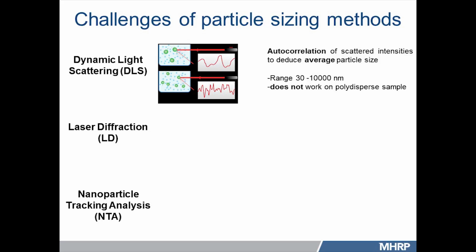But as I said, it does not work well on a polydisperse sample when there are large size liposomes, large size particles. They tend to mask the abundance of small size particles, and hence this is not the technique of choice for our formulation.